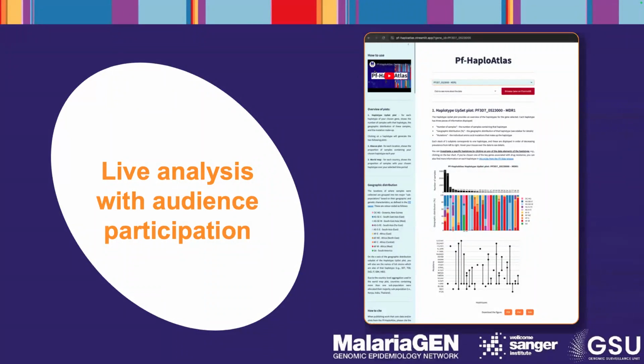And if you have Illumina whole genome sequence data and you can make that publicly available, for example, on the European Nucleotide Archive or the SRA, with some minimal sample metadata, so there's a minimum of a year and country of collection of each sample, then the intention is for future releases to pull in all of that data, to run it through our mapping and genotype calling pipelines, and then ultimately all that data will end up within this app. But do please contact us, support@malariagen.net. Thanks for the question.